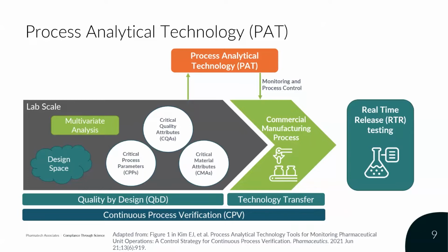You might start with blending, and then the blend is then segregated into containers which have to be sampled, stored, and then the samples sent to the analytical lab for testing. And reporting of the data concerning the quality of the intermediate often has to be held, you have to wait until that testing is available before you can continue to the next step.